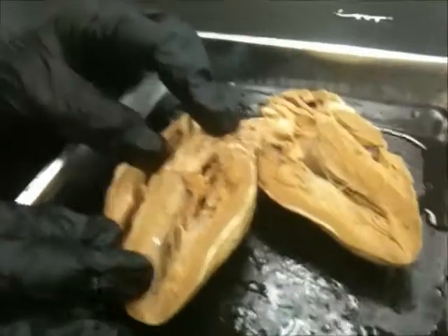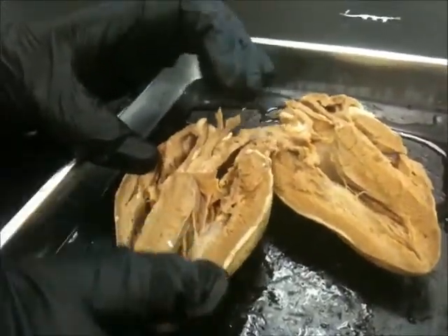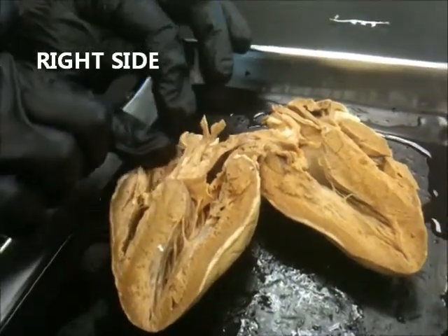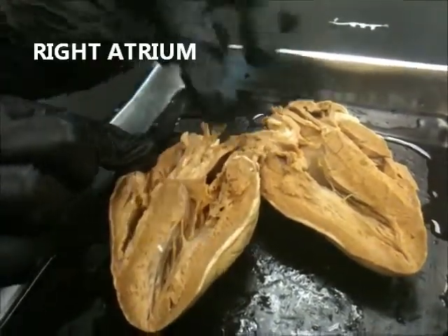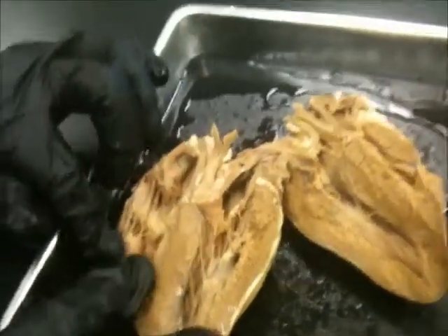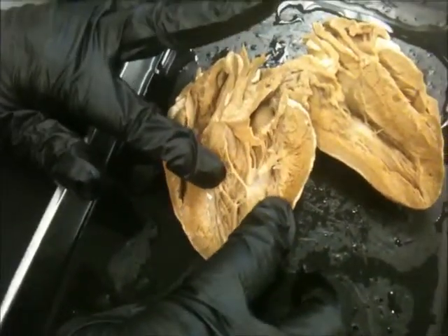So what do we have to know on our sheet? We have to know if this is the left side, this is the right side. So this would be the left or the right atrium — left atrium. The right ventricle and the left ventricle.